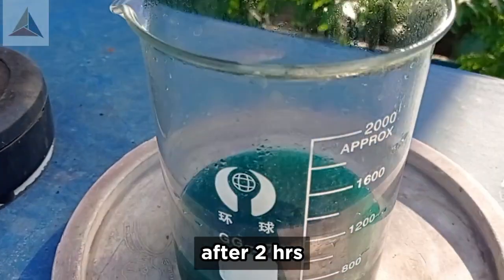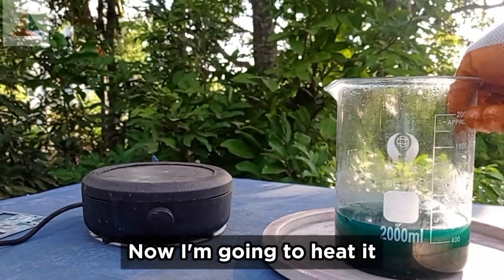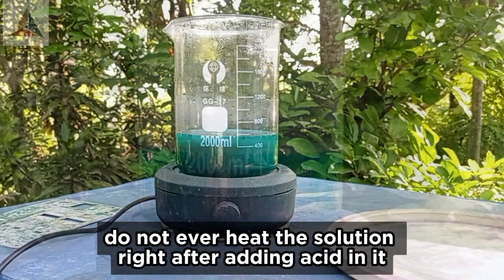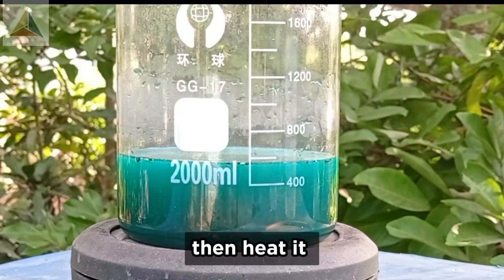After 2 hours, now I'm going to heat it on a heating plate at 100°C. Do not ever heat the solution right after adding acid in it. Wait till the reaction dies down, then heat it.